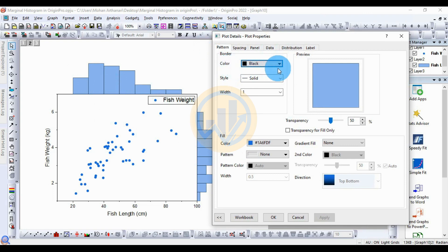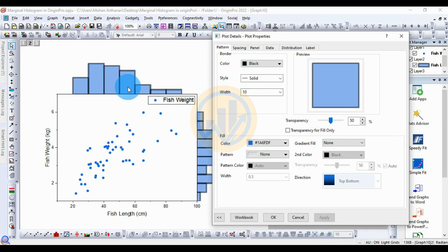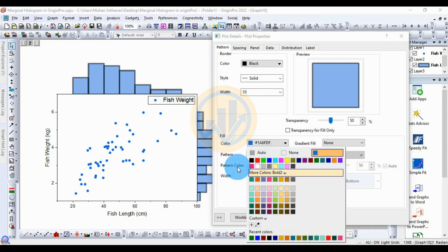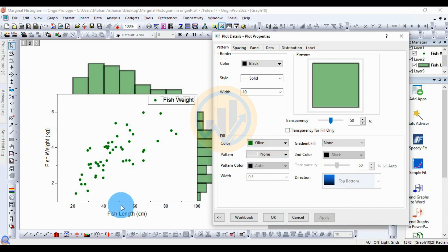In the Pattern menu, choose the border color as black, style as solid, and width as 10. Click Apply. For the fill color, choose Single Color and select olive green. Click Apply to update the histogram and scatter plot colors.